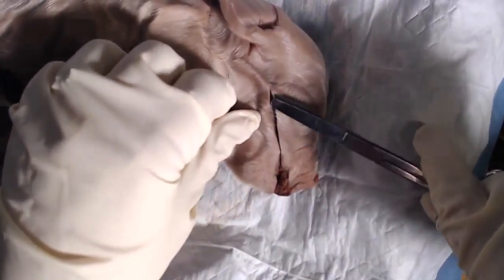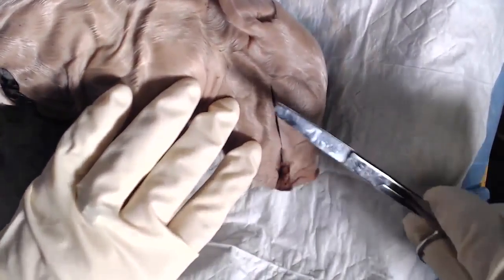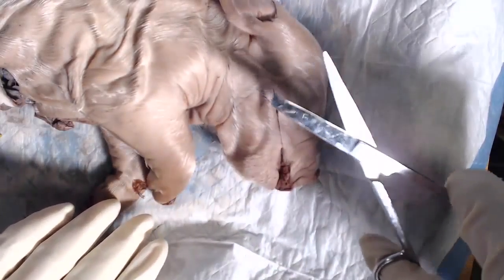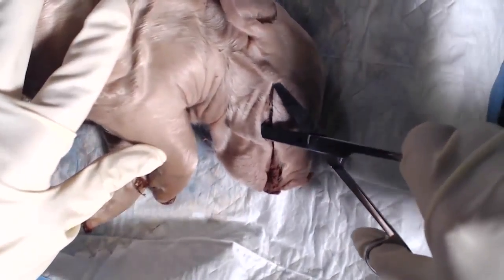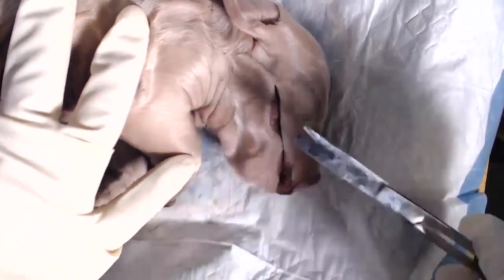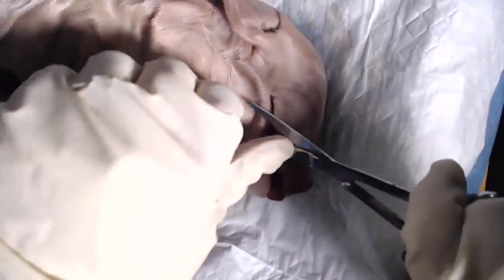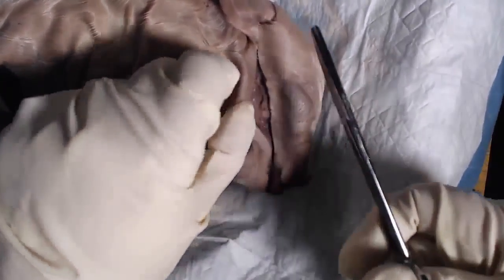As you're going, use your scissors to separate the skin from the underlying structures. You want to use a motion like this with my scissors. I'll show you here. You want to move your scissors outward as you're going through the tissue, so you separate that skin this way. That's just a technique we use to easily remove that tissue. You can continue your cut towards the ear.